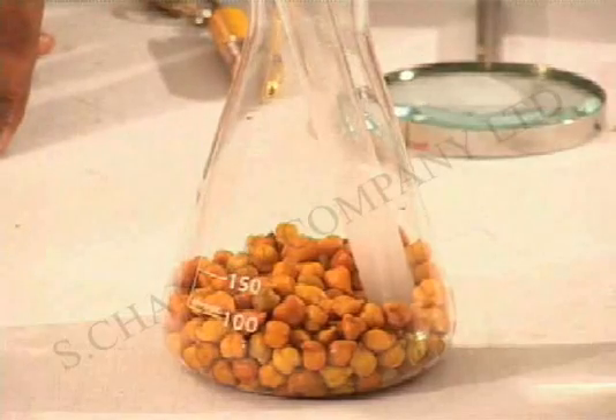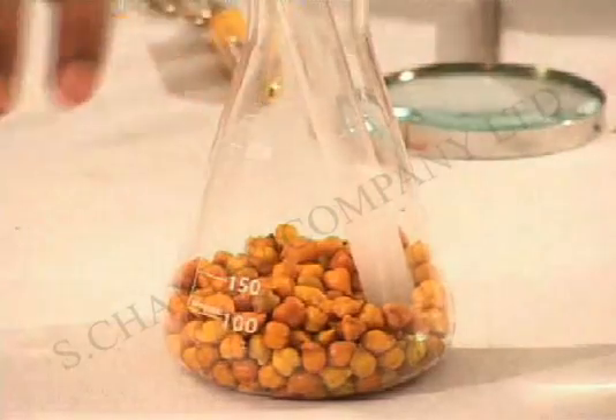As is very evident from what you are seeing right now, the lime water in the test tube has turned milky.